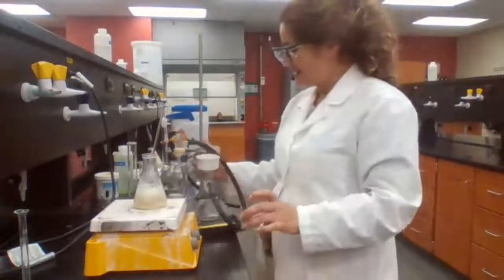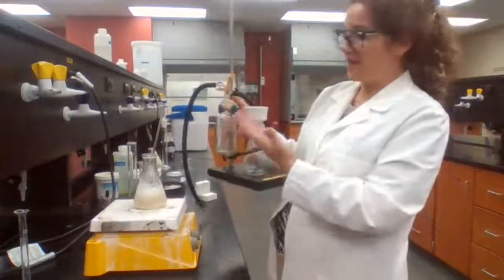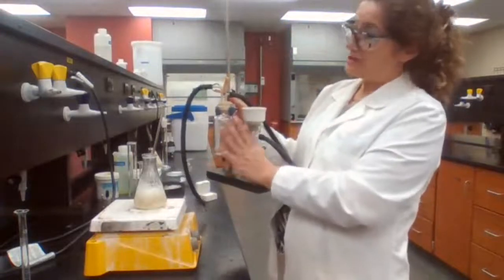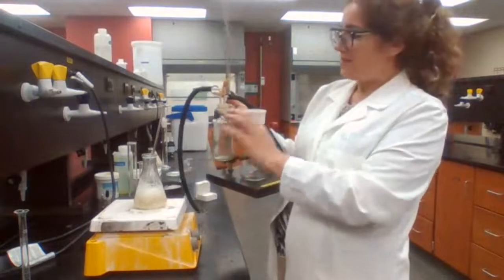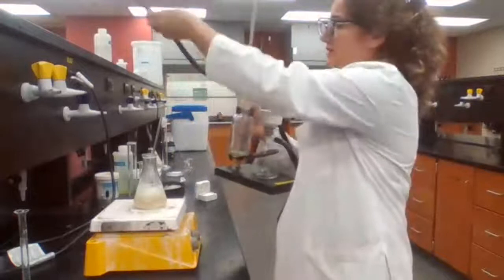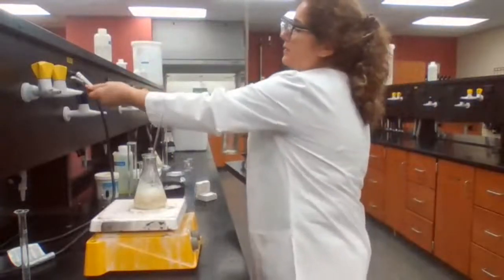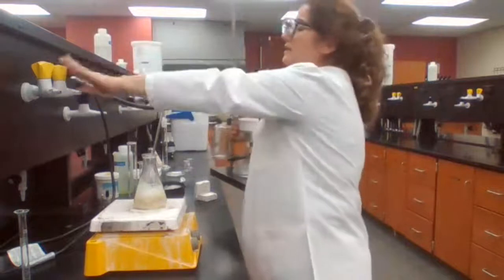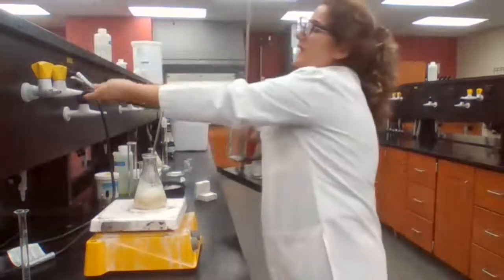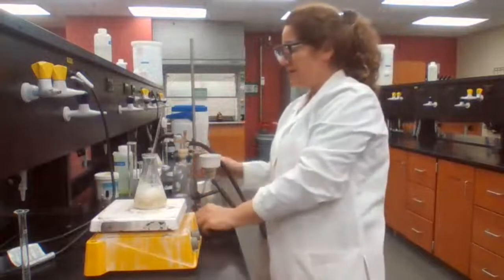We also have another component in our system, which not every lab uses: a trap. The trap goes between the vacuum flask and the vacuum. We have a vacuum pump downstairs; when we turn it on, vacuum is applied.